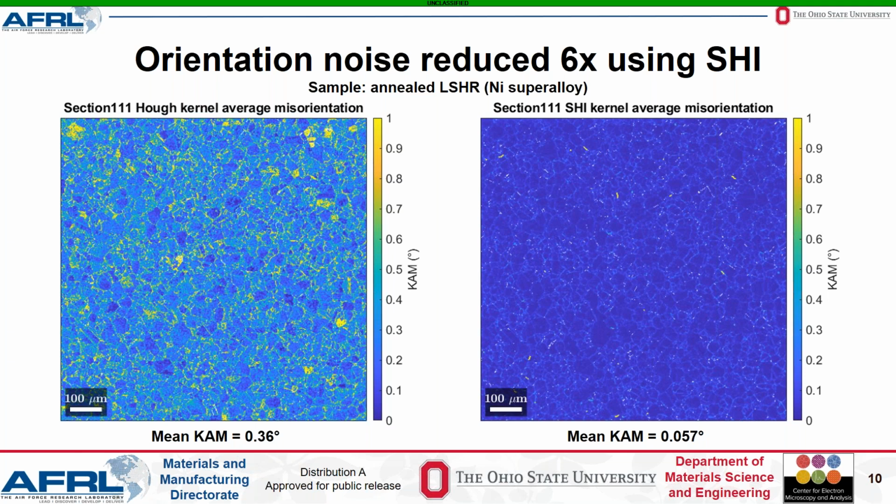In particular, again, the dictionary and spherical harmonic indexing can be very robust to noisy patterns, but the precision would almost certainly decrease significantly. And it's a lot harder to characterize exactly how bad the precision is in, say, a deformed state versus an undeformed sample. Although if you have a magnetic undeformed sample, I suppose that could be tested.